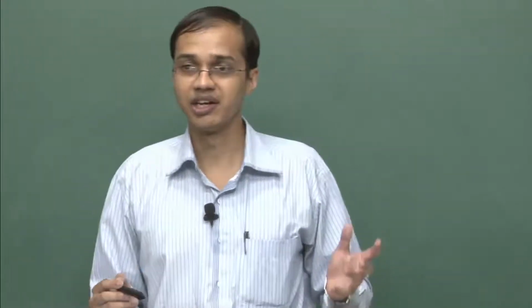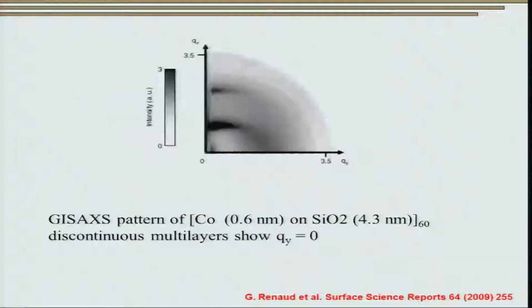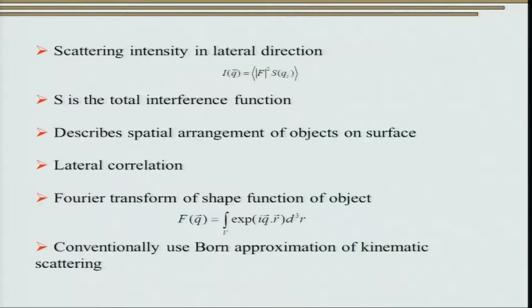We talked about form factors, as well as the interference factor, the interference pattern. So let us go back and have a look. This is your interference function. So we have the form factor and we have the interference function. Let us see now how actually they coincide.